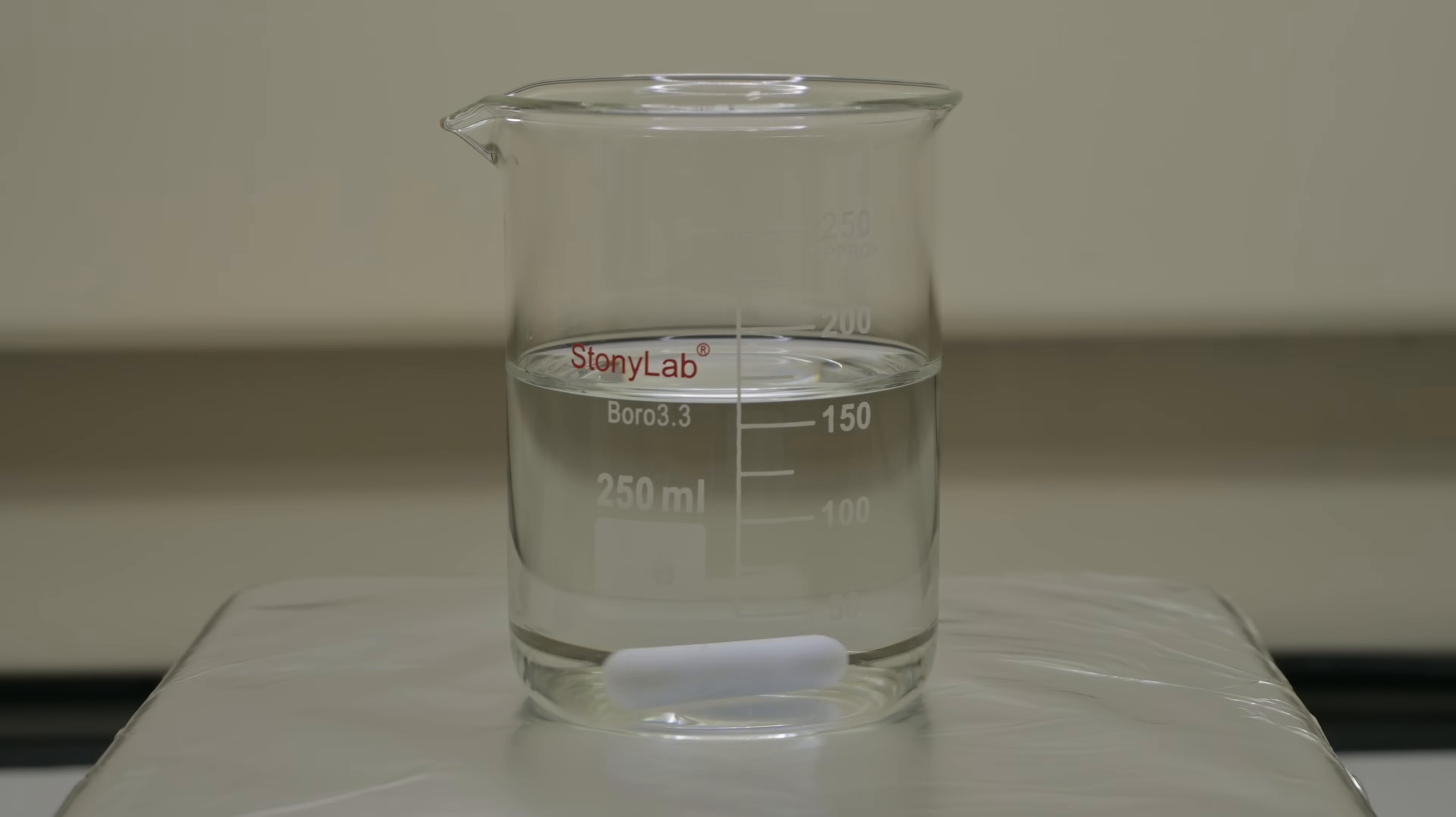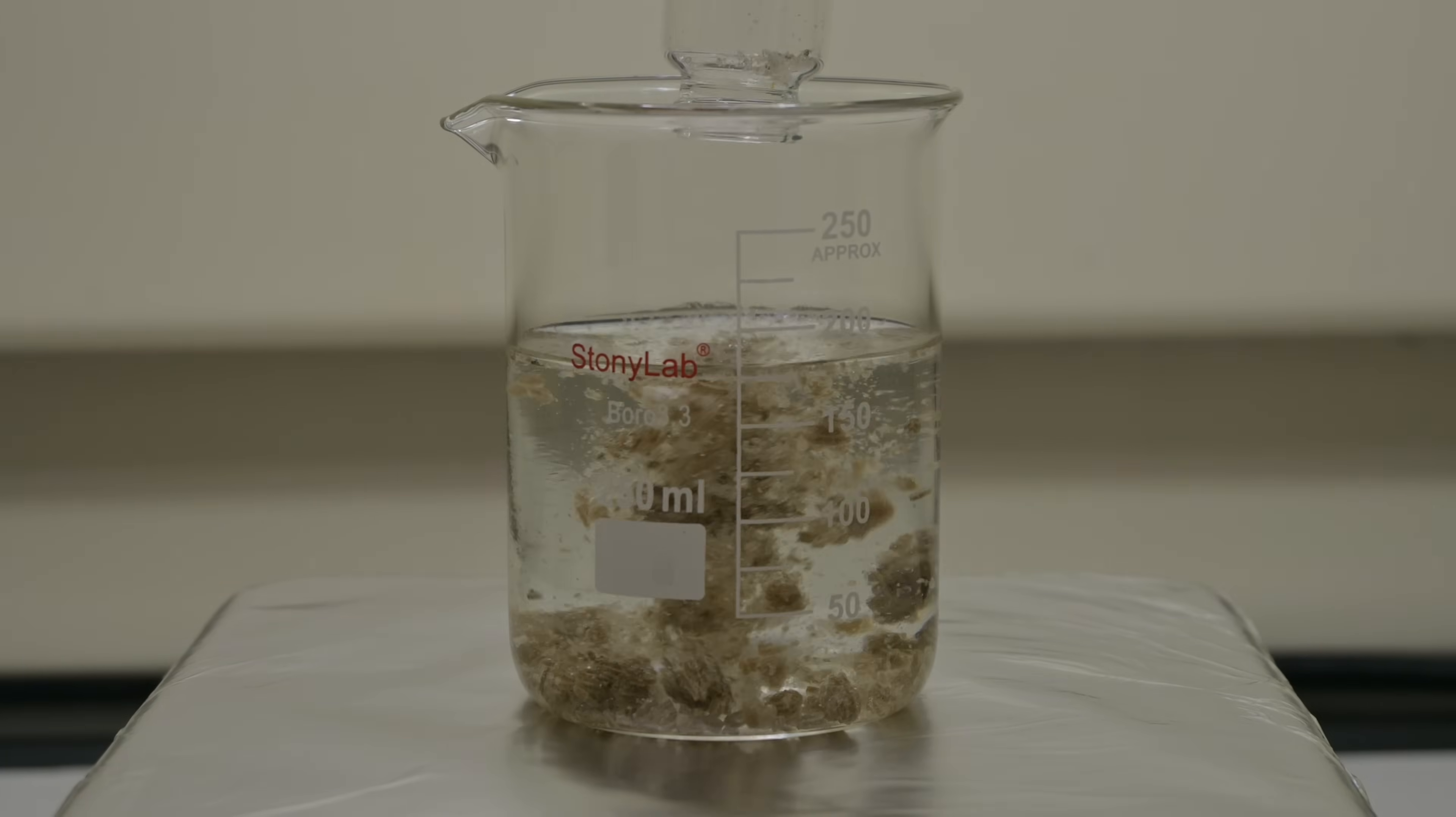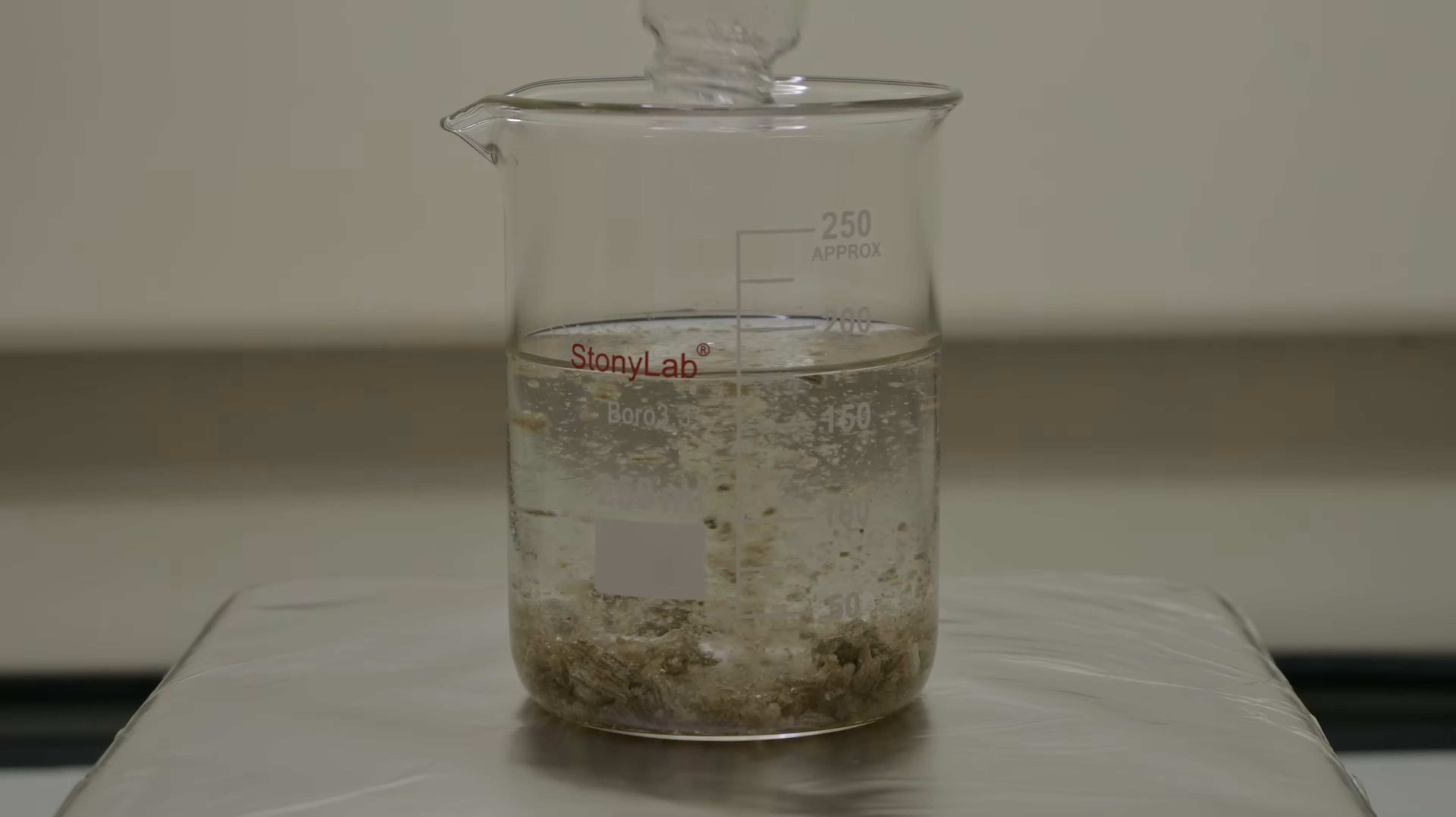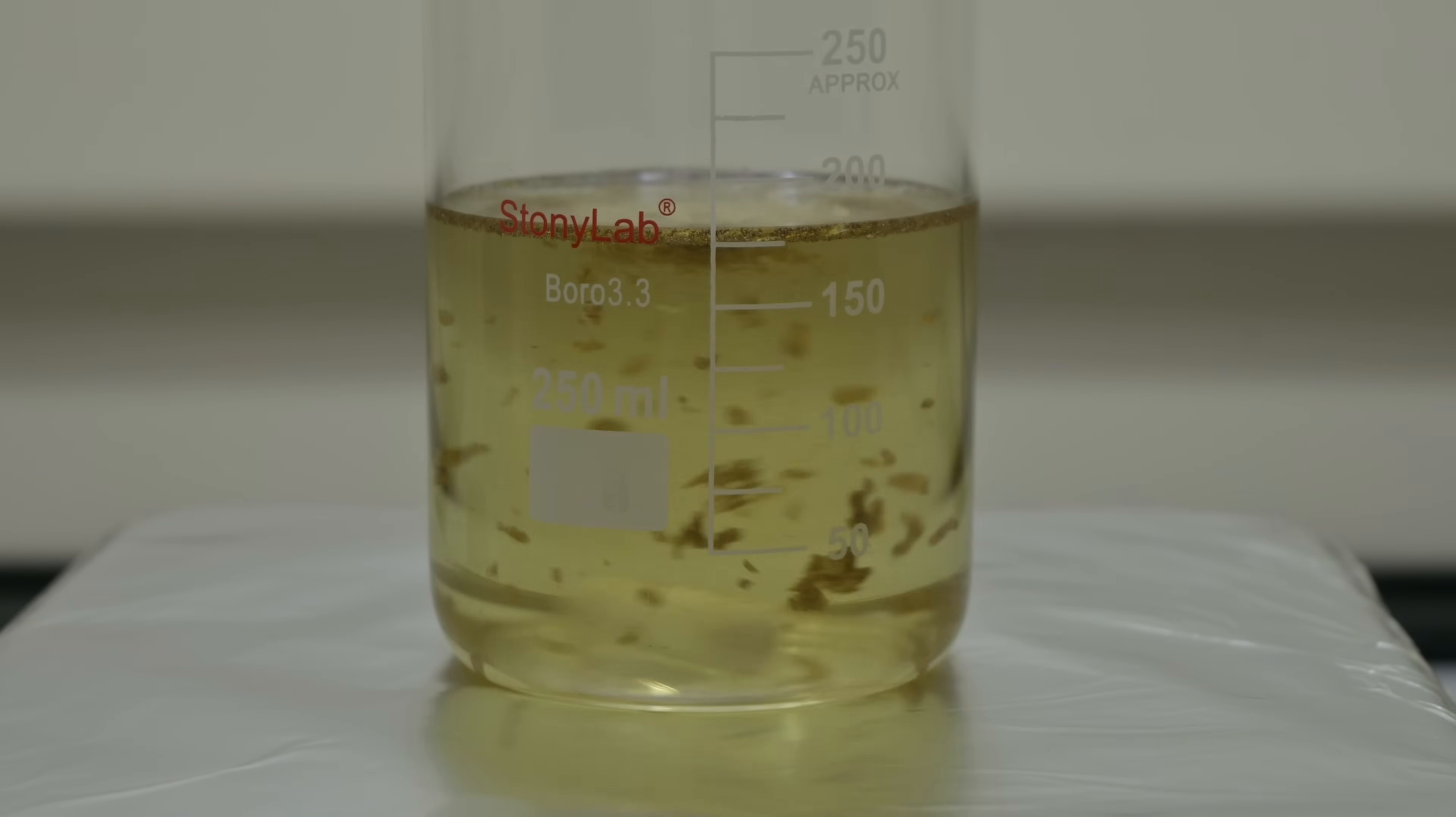I start by adding 6.5 mL of concentrated hydrochloric acid to 175 mL of distilled water in a beaker. Next, I weigh out 7.5 grams of p-toluidine and add that to the beaker. The acid helps dissolve the p-toluidine by reacting with it to form a water-soluble hydrochloride salt. This step is critical, because p-toluidine itself doesn't dissolve very well in water, but once it forms the salt, the amine group becomes protonated and more polar, allowing it to dissolve completely.